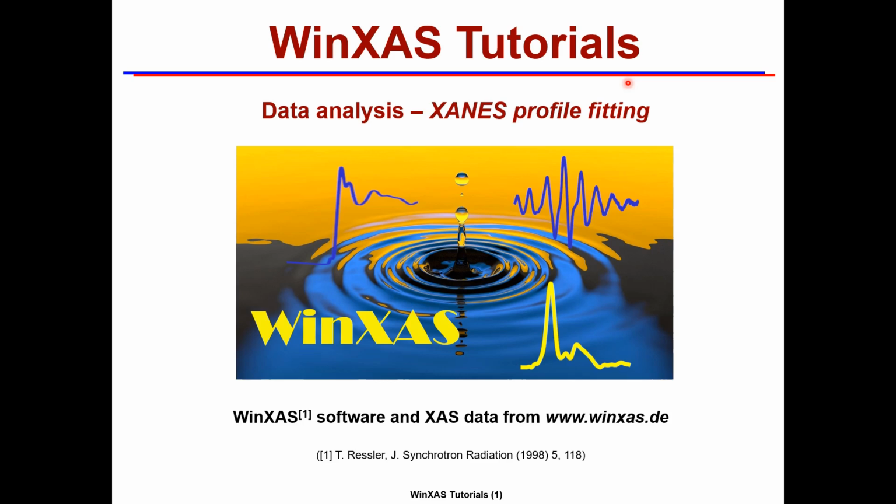While previous tutorials were all about data reduction and raw data treatment, this is the first tutorial about XAFS data analysis. We want to start with the XANES region and introduce procedures to extract coordination geometry and average valence information. As always, the WinXAS software and the XAS data I will be using in the hands-on session can be obtained from the WinXAS website.